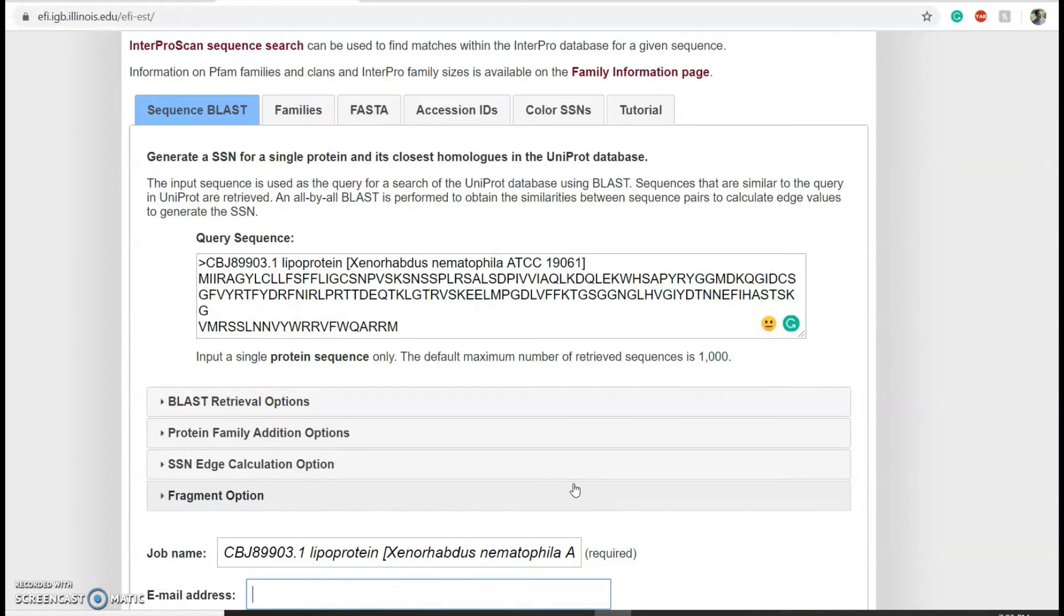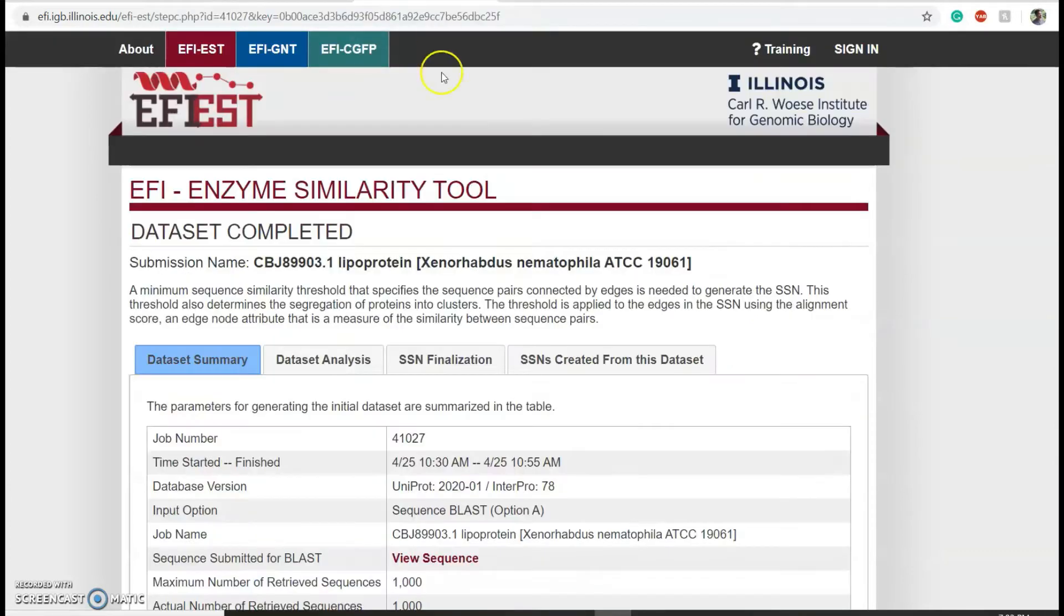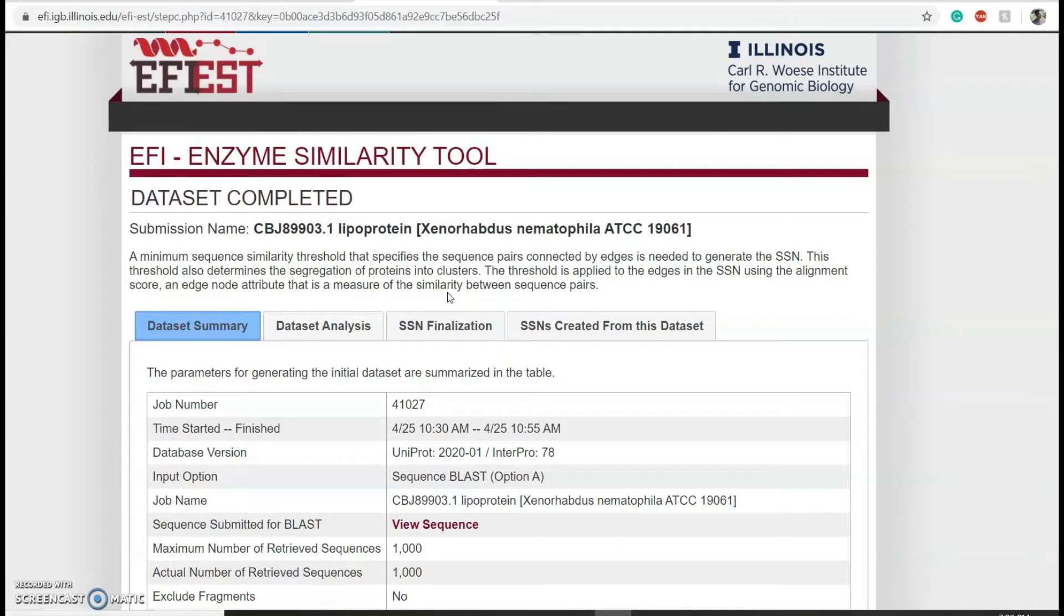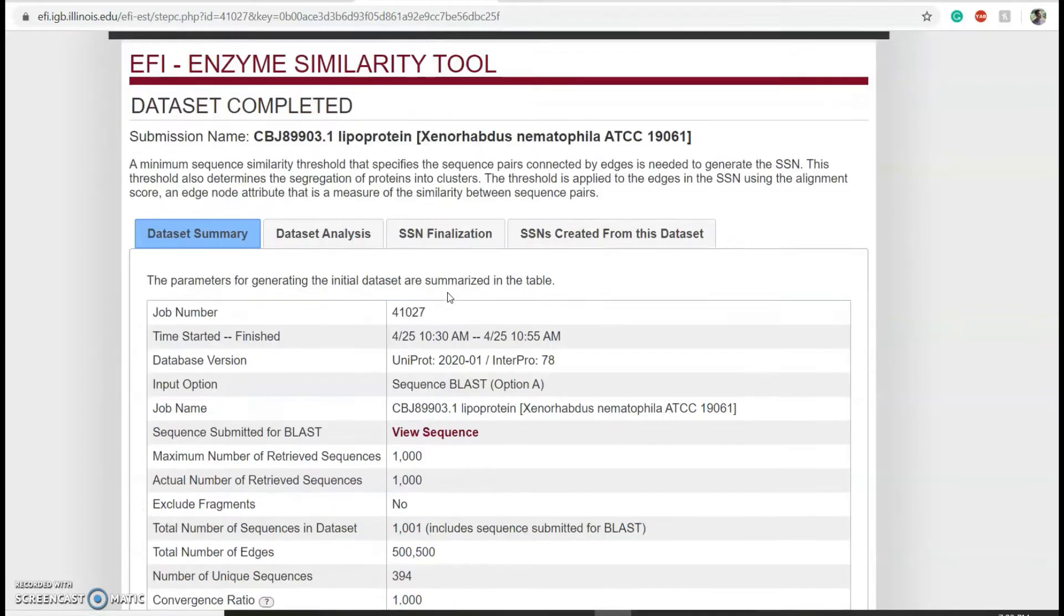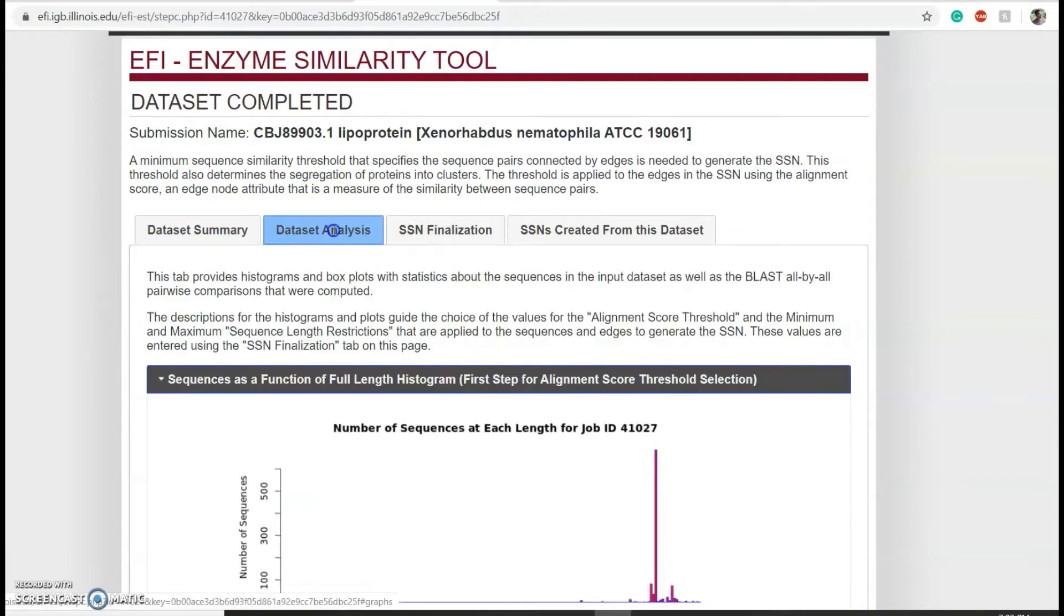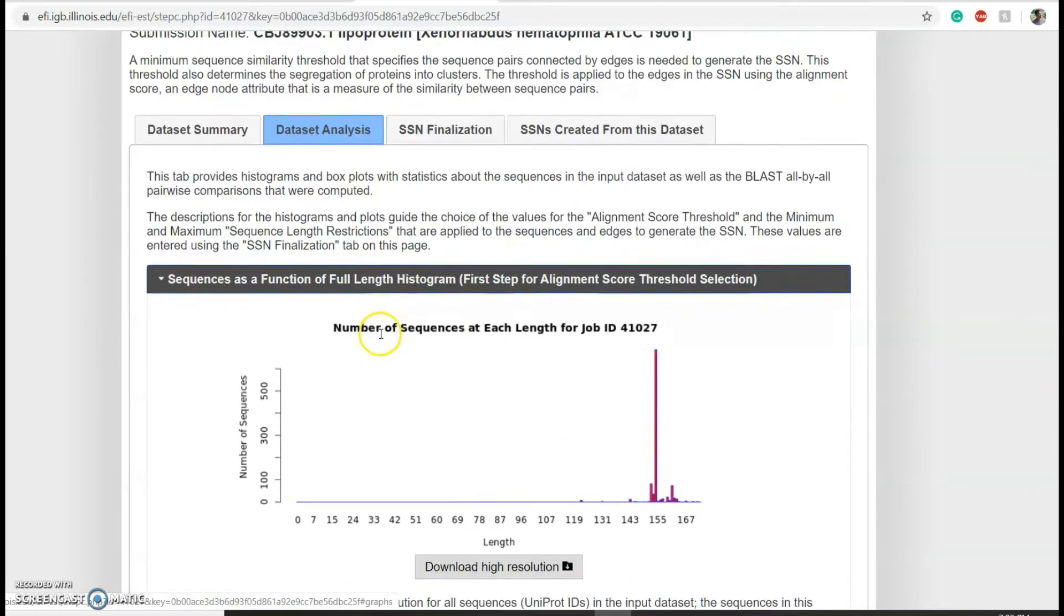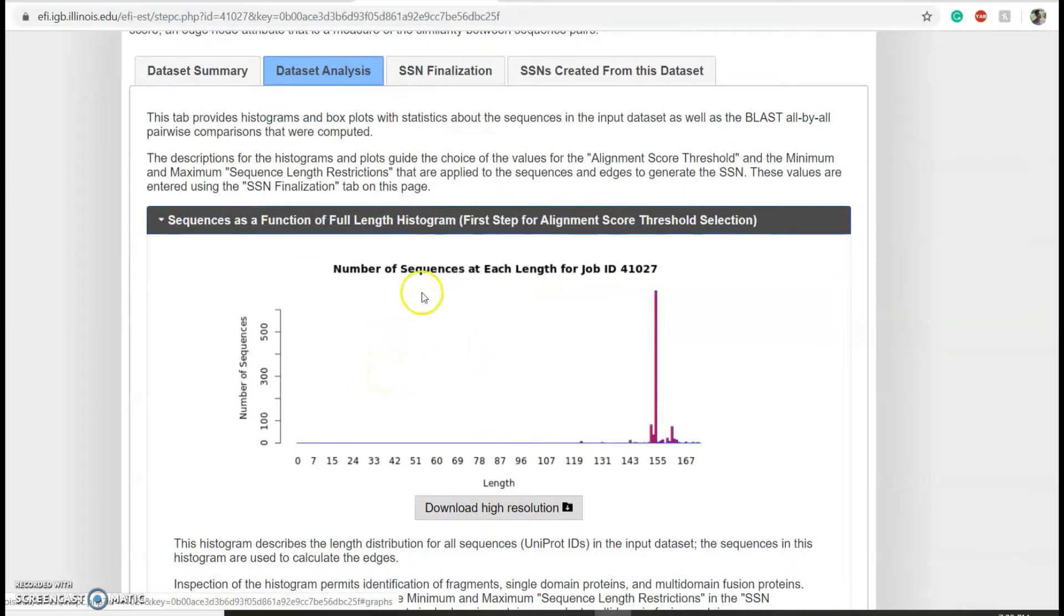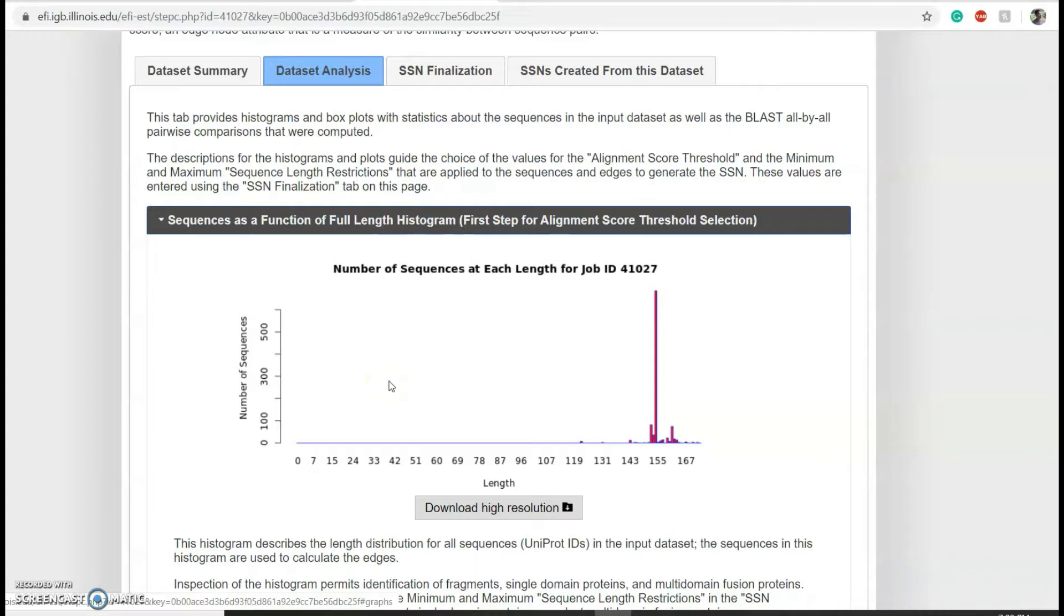Once you get the email, click on the link provided and you'll get to this web page with initial analysis of the sequences that you got. For example, if we click on dataset analysis, you can see a histogram of the sequence length of the homologs retrieved.